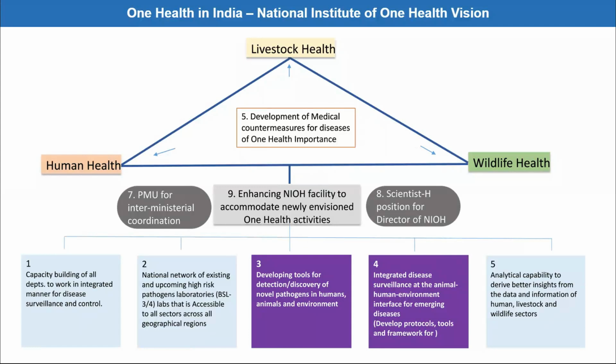As we all know, in any outbreak, identification of the pathogen through next generation sequencing becomes a very essential tool, which everybody realized during the pandemic. This leads not only to knowing about the pathogen, but helps in making new vaccines and creating a lot of knowledge which can be translated further into research.